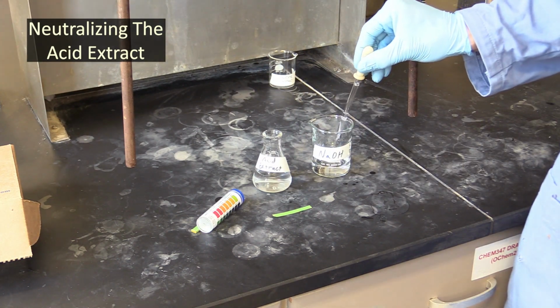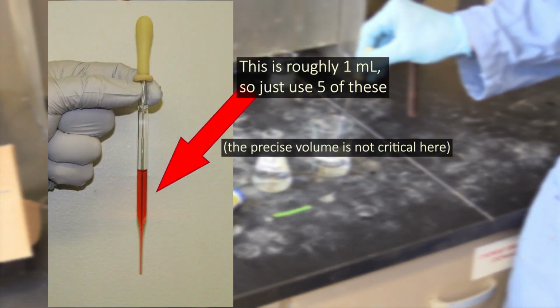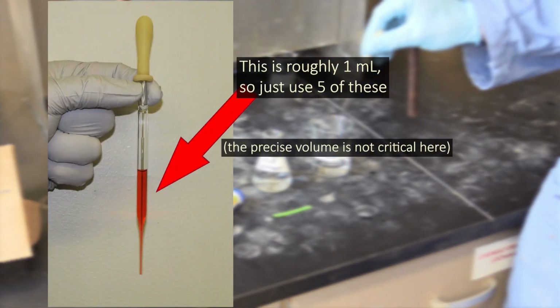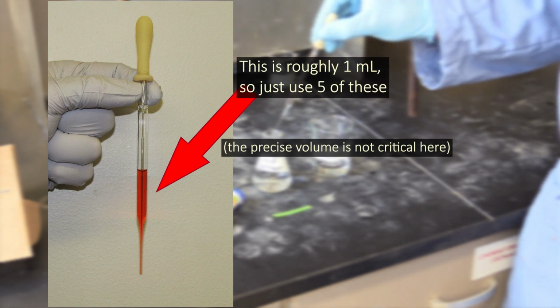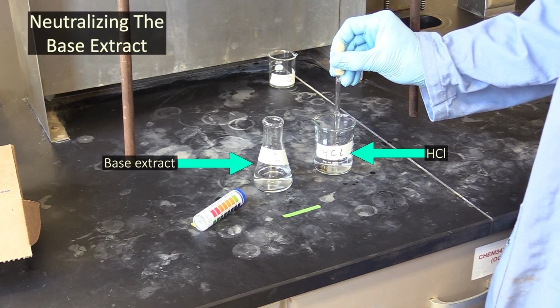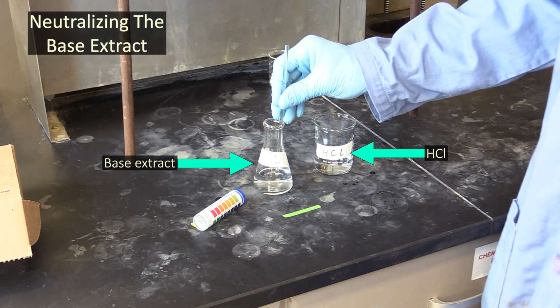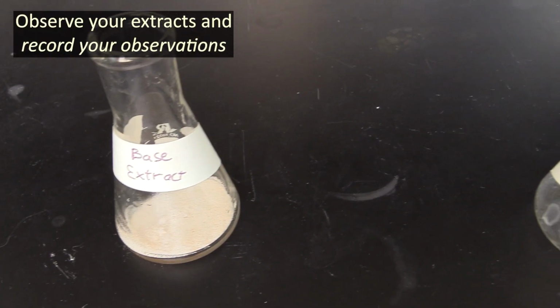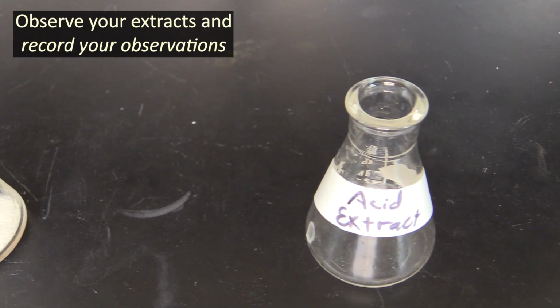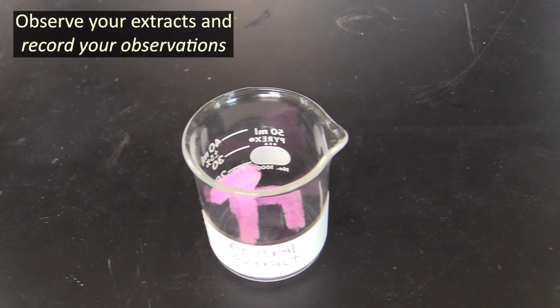As you probably noticed, we used a Pasteur pipette to add the sodium hydroxide. These tend to pick up about 1 milliliter with each use, so you can add 5 pipettes worth to your extract when you do this part. You'll neutralize the base extract the same way, except you'll add hydrochloric acid to it instead of sodium hydroxide. And finally, take a good look at your 3 extracts and record what you see in your lab notes. This info will help you determine which of the 3 extracts your benzoic acid ended up in.